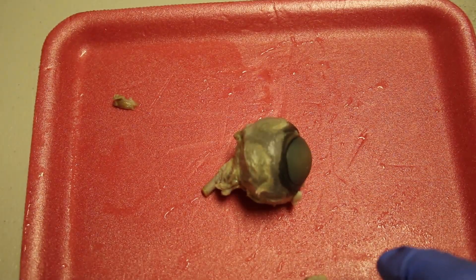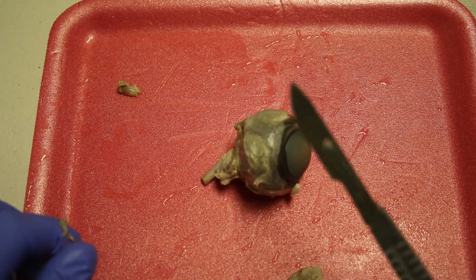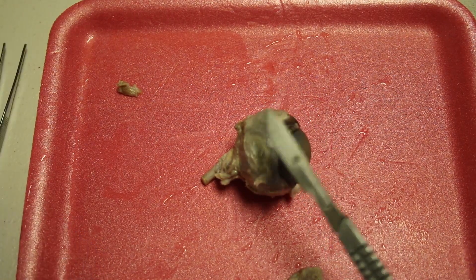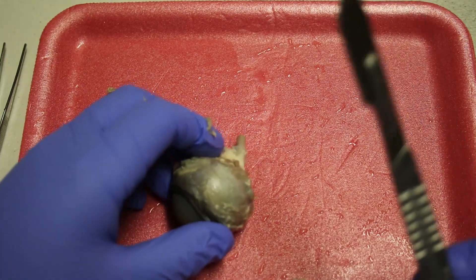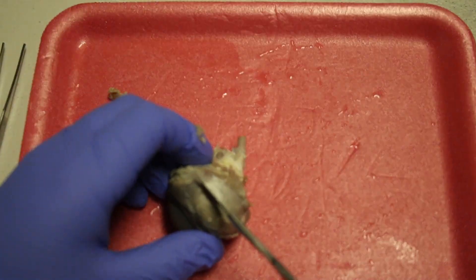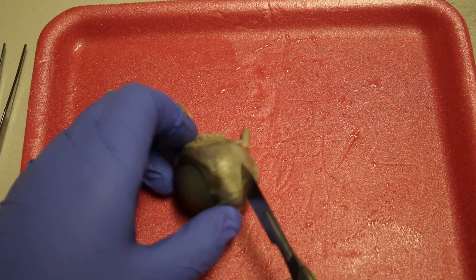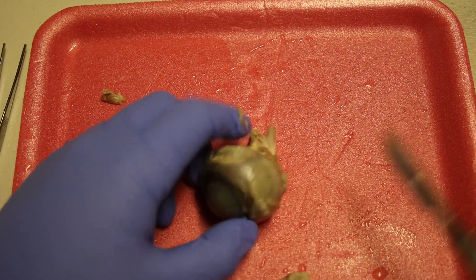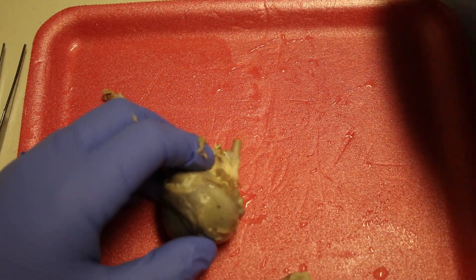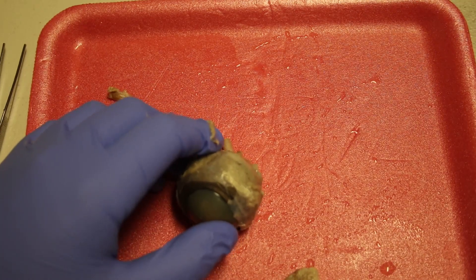Now that the tissue is removed, we are going to make our first dissection. I'm going to start my equator cut with my scalpel, but you can use your scissors — there are multiple ways you can do this. I'm going to make an incision here. And as it popped, you can see the vitreous humor has started to seep out.